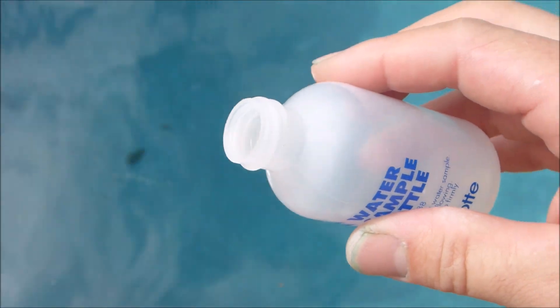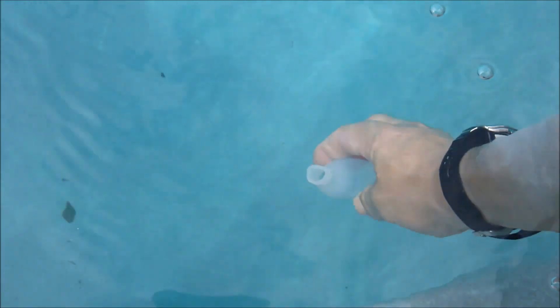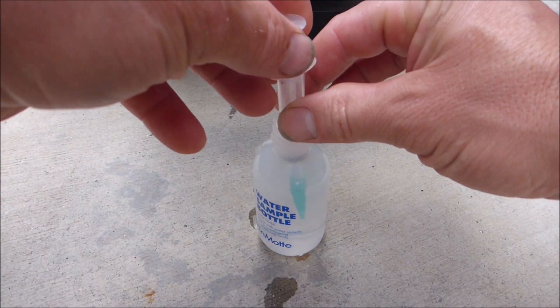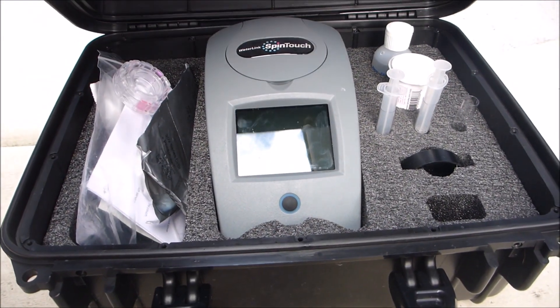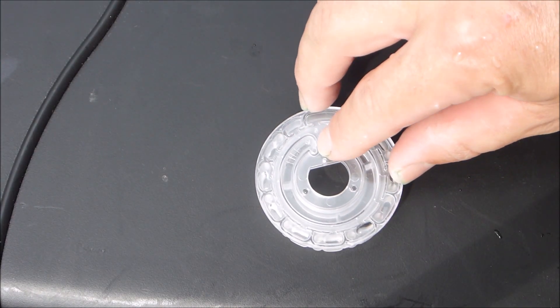You take the water sample bottle and dip it in up to your elbow in the pool to get a good water sample. Then you take the syringe and draw the water sample from the bottle. This is enough to fill one disc, and it's much easier to fill the disc on top of the case. You take the syringe and stick it into the fill hole right here.